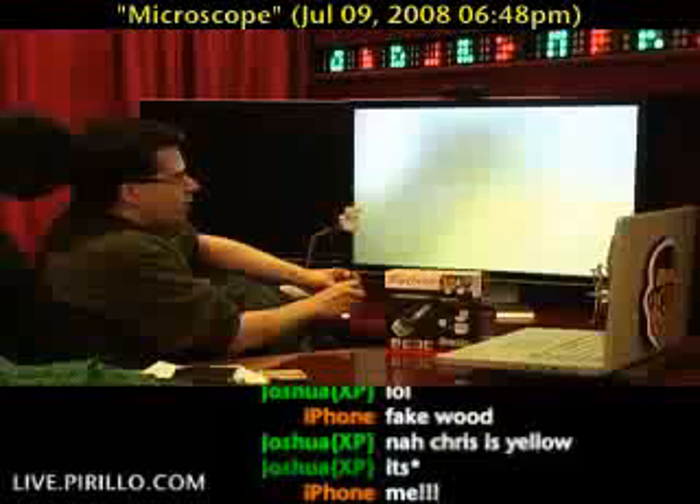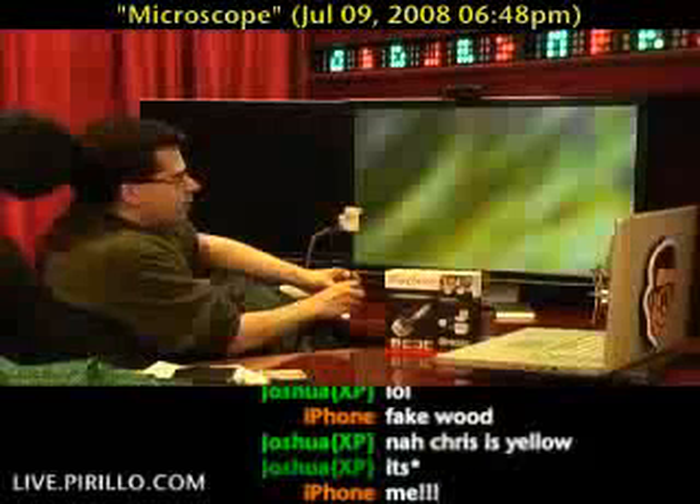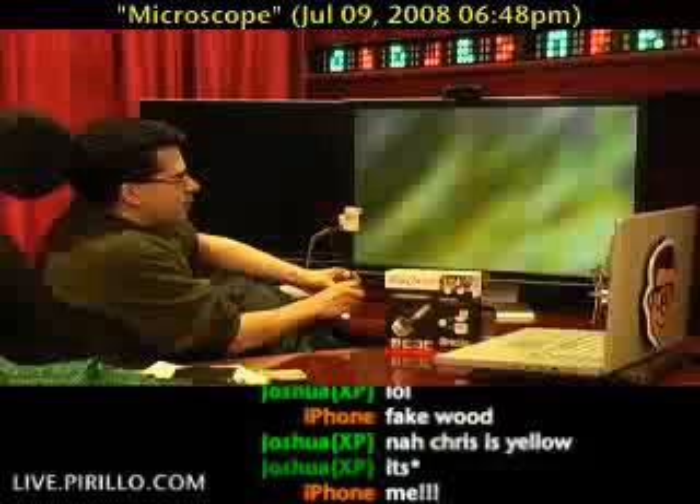Let's take a look at a dollar — I guess it's a $20 bill. Let's see if we can get Andrew Jackson's eye here, if I can find it. It's so hard — if you just make the smallest move, it moves by miles. I thought there were words in here somewhere. The problem is the magnification is so strong. I can change the magnification just by zooming out a bit, so I'm able to tell a little bit more there.